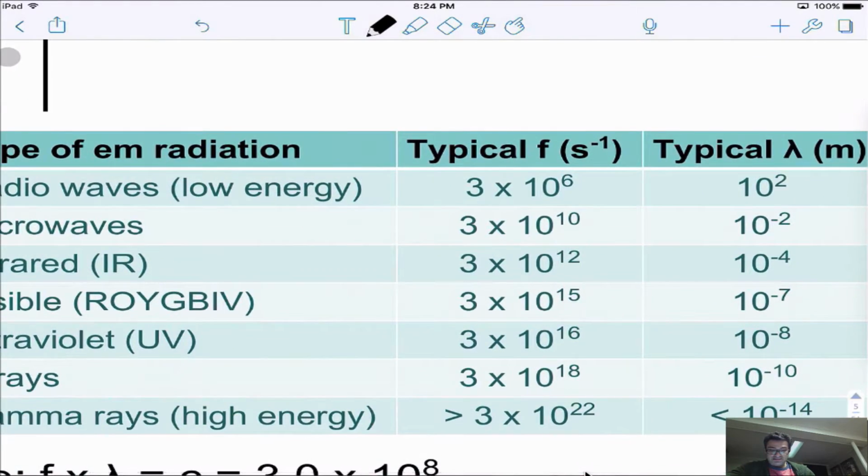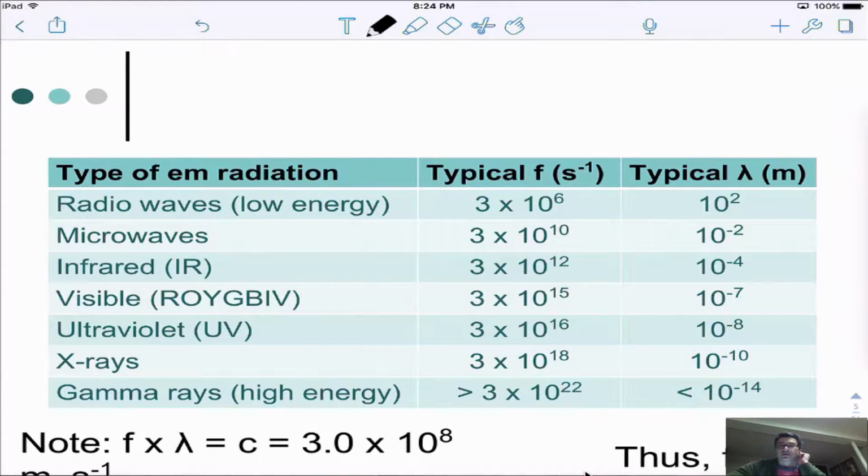And so you can see the typical frequencies for different types of radiation that can be given off. And we have this infrared light here, which is one of the less powerful forms compared to ultraviolet, which is more powerful. And what you're going to see with the infrared spectroscopy when we talk about it today is how it gets the molecules' bonds to wiggle, or to vibrate or to stretch. And that form where you stretch it and you get the bonds to wiggle is able to be detected. And we can tell what type of bonds they are by comparing it to known bonds.